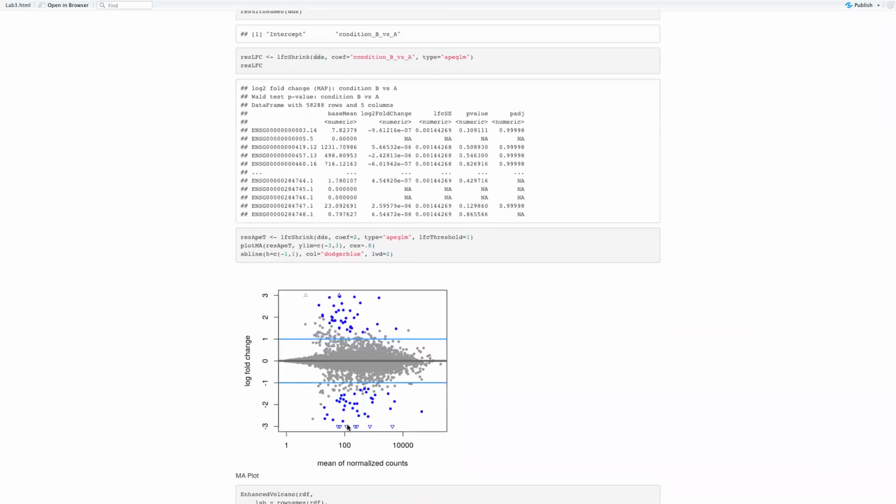You can also adjust the axis. Maybe you can see here there are some genes further away, with more than log2 fold change 3. You can change this to -5 to 5 so you can see the whole picture. And sometimes you can even label the gene names of the genes that have really different log2 fold changes.